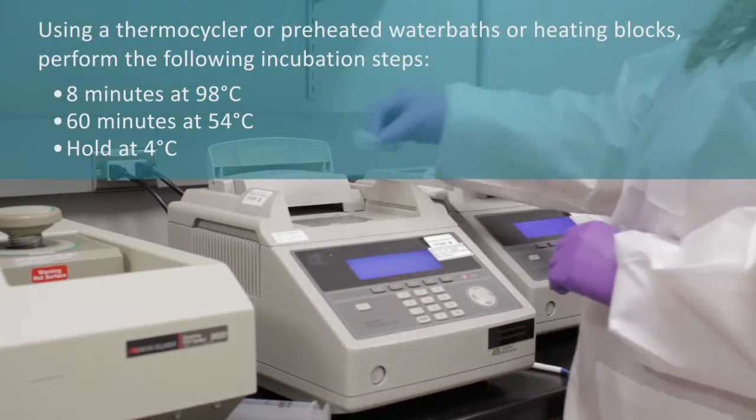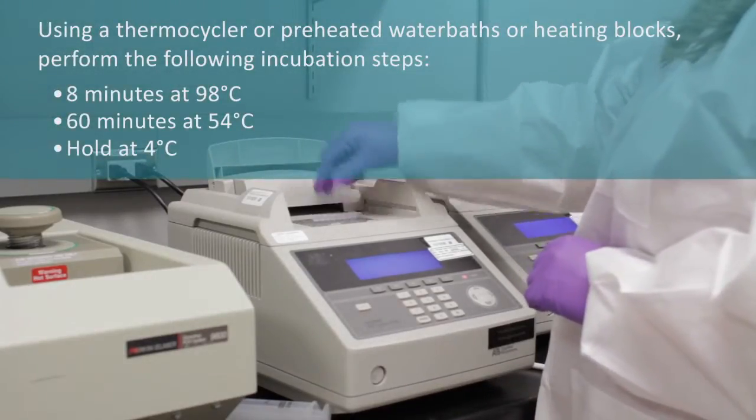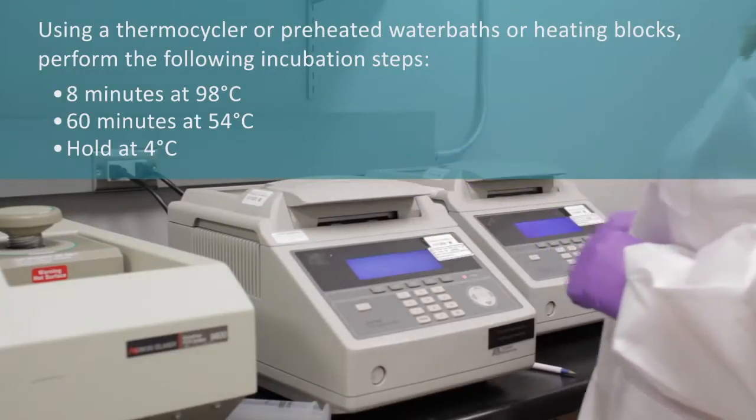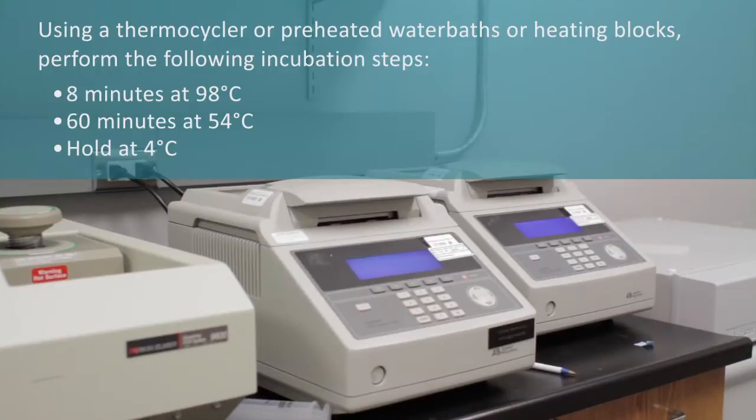Using a thermocycler or preheated water baths or heating blocks, perform the following incubation steps: 8 minutes at 98 degrees Celsius, 60 minutes at 54 degrees Celsius, then hold at 4 degrees Celsius.